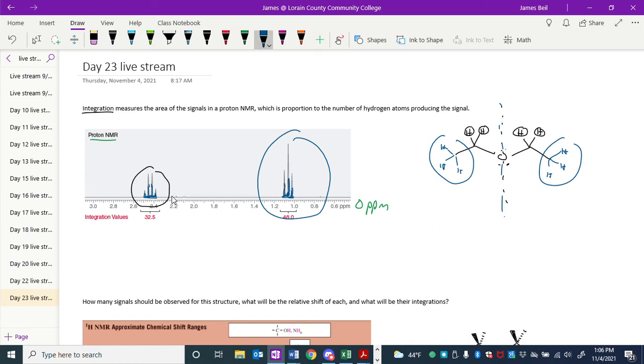So nowadays we don't have to cut that out and measure the relative mass to figure out the relative areas of the signal. We have computers that can do calculus, obviously, and they can calculate the area or integration of the signal. And typically, when that's done, you're using a software that allows you to pick out exactly where you want the area to be calculated. So I would pick out this area in here, and it would calculate an integration for that. And then I would tell the computer here and here, here's where I want the other sections' integration to be calculated. And the relative integrations would be shown with these little integral symbols. And then you have to tell the computer what the integration is for one of these peaks, and it will give you the relative integration of the other. So if one of these has clearly a smaller integral than the other, I could set this to 1, and I would find out that relative to that, this one comes out to about 1.5.